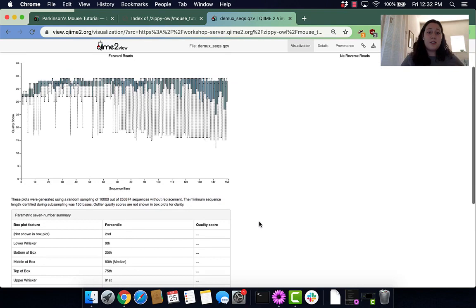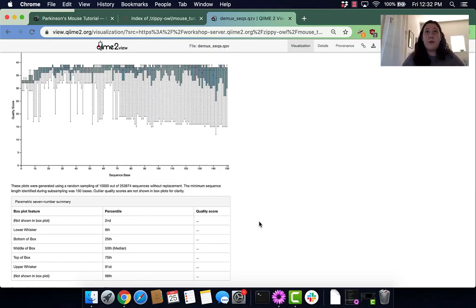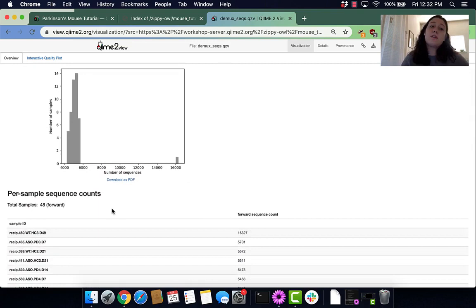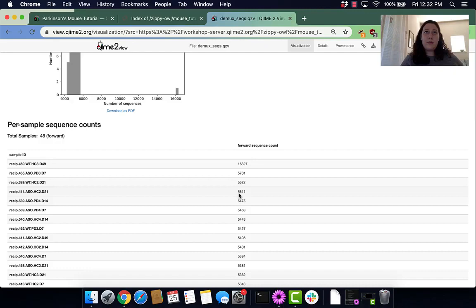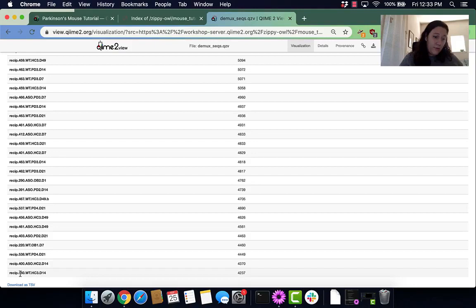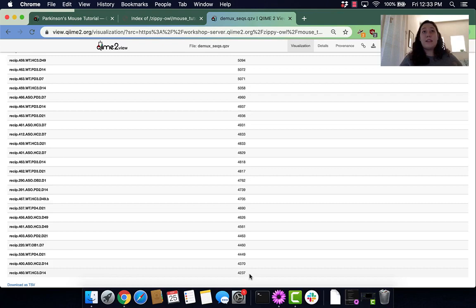The top discussion question says, after demultiplexing, which sample has the lowest sequence depth? We can find that in our overview, in our per-sample sequence counts. The highest sequence count is at the top, so the lowest one is at the bottom. Our lowest one is recipient 460W with sequence counts of 4,237.